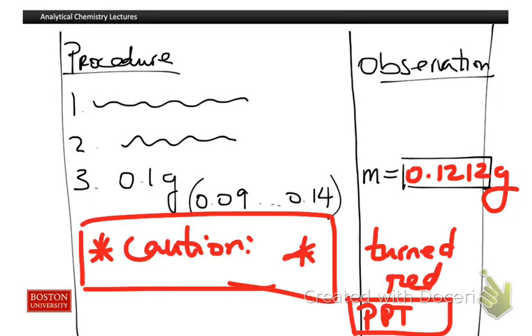I think what's most important is that we make sure that our lab notebook pages are functional, have everything that we need, that they're well prepared in advance, that they really bring our eye to what we're supposed to be doing in the lab, and that they're tuned for ourselves. We know whether we can digest small steps or big steps. So whether the lab manual uses a big paragraph or short bullets, we can really rephrase the procedure in words that'll be speaking to us and really guide us through what we're doing.